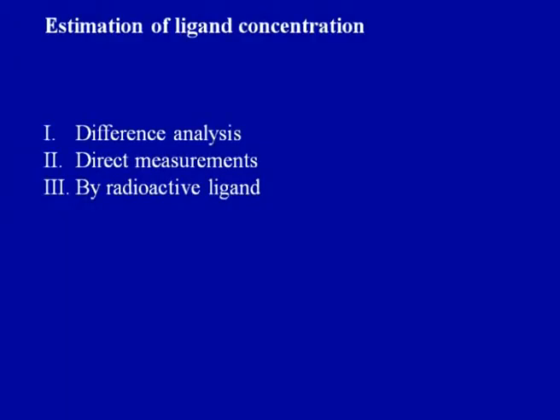There could be direct analysis. This could also be done by a radioactive ligand. Now, if the radioactive ligand is incorporated into the coupling reaction, then it could be analyzed for total immobilized ligand. So, there could be different methods to analyze the ligand binding in here.